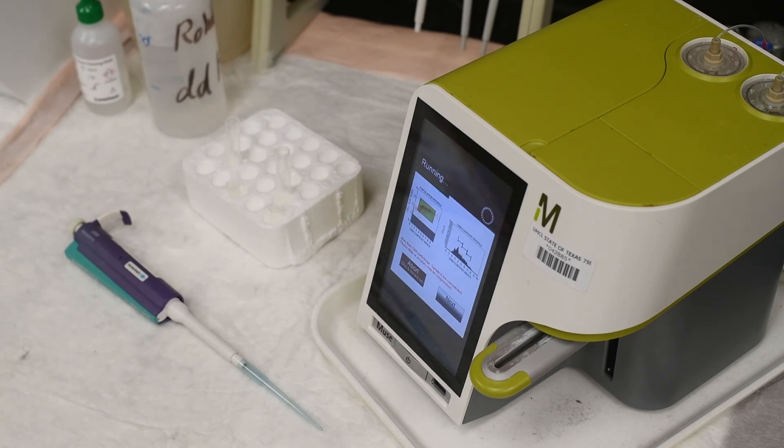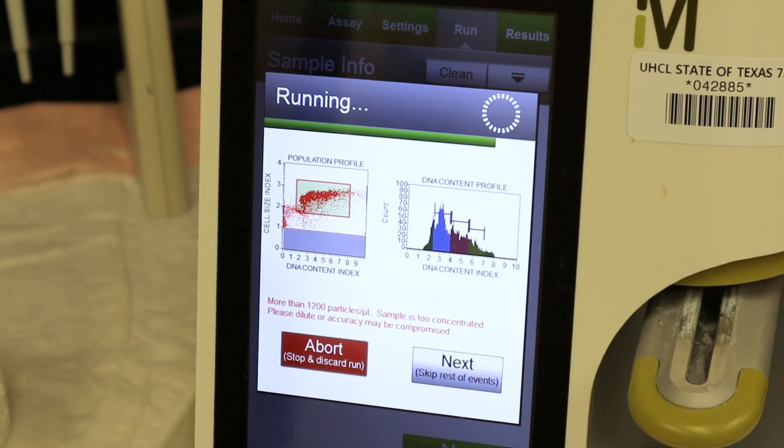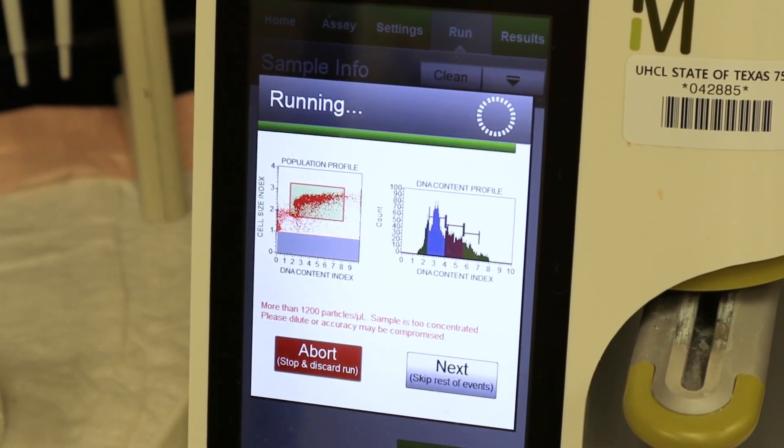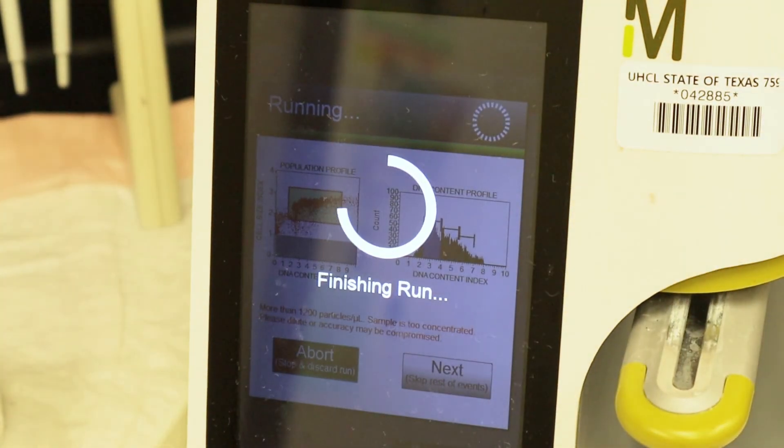As expected, most of my cells were in the G0/G1 phase. My plate was around 65 to 75 percent confluent when I fixed my cells, and a good portion of them were freshly replicated and adherent to the plate. The other phases were most likely the cells that had lifted and were either in the S phase or going through mitosis.